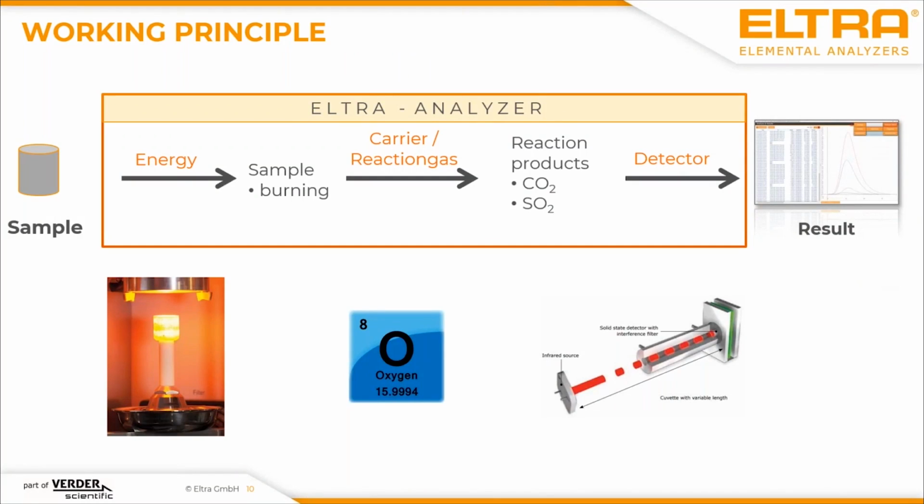Yes, thank you very much, Khan, for the introduction. So I would like to continue explaining to you how the typical elemental analyzer works. And later we will come to the point, what can I do to get best results? But first to the principle.